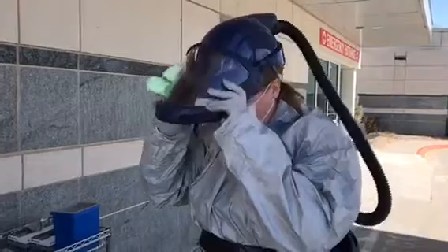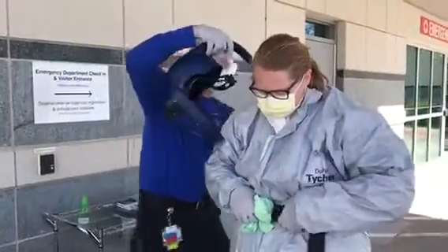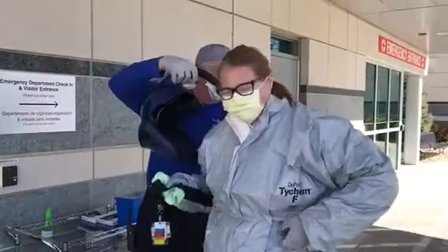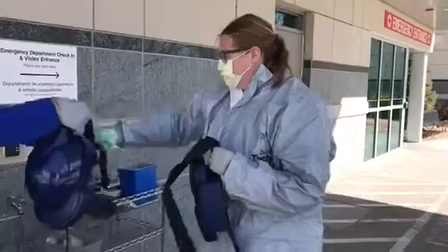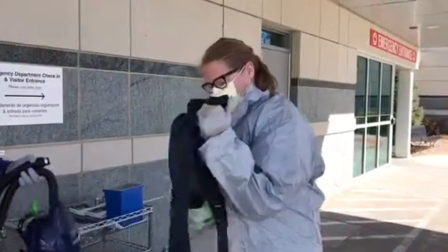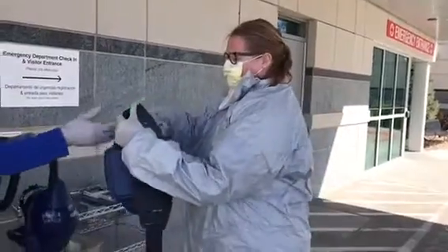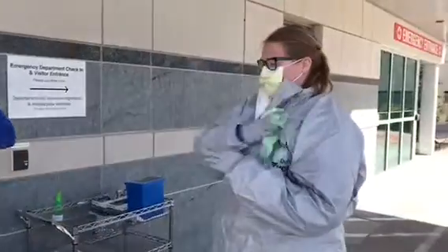She will then take the hood off and hand it to the secondary nurse, and then she will wipe off the hose and the PAPR machine. The secondary nurse will take the PAPR machine from her and make sure it is turned off as the primary nurse continues to wipe off her entire body.